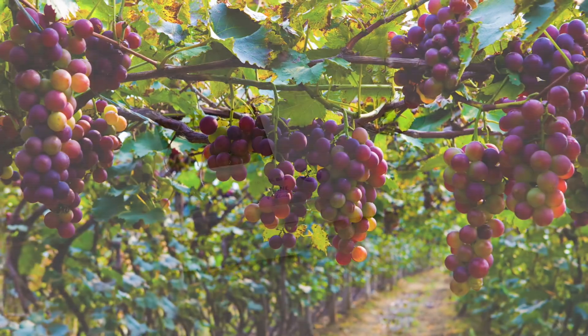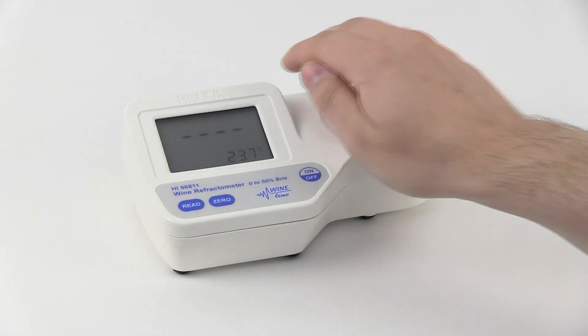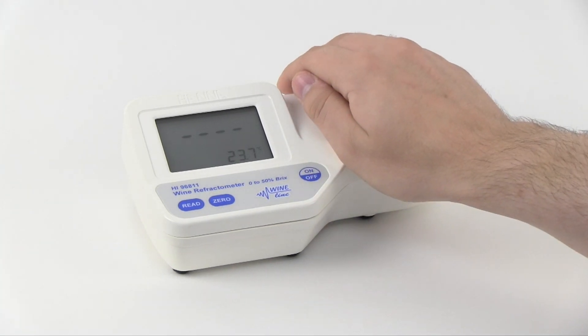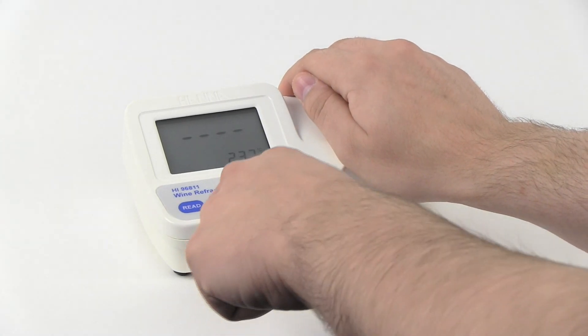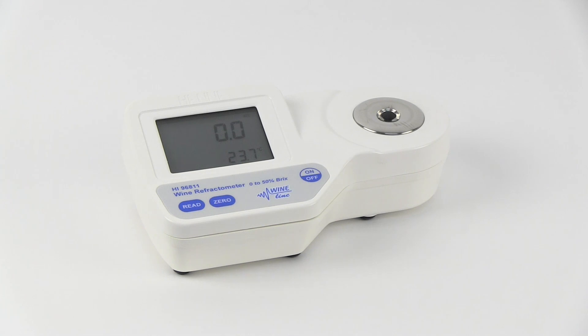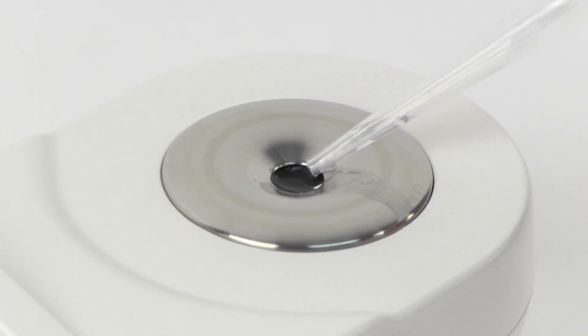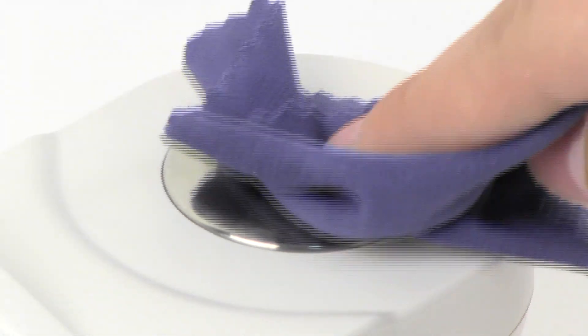The HI-96811 features one-point calibration with distilled water as the zero-point. Calibration is performed simply by placing a few drops of distilled water on the sample well so that the prism is completely covered, covering the prism with your hand to avoid light interference, then pressing the zero key. If no error appears, the instrument is now calibrated. The prism can now be cleaned by gently absorbing the water with a plastic pipette or a soft cloth.